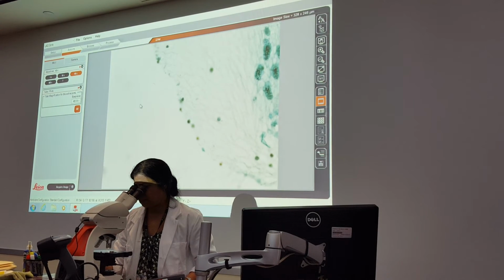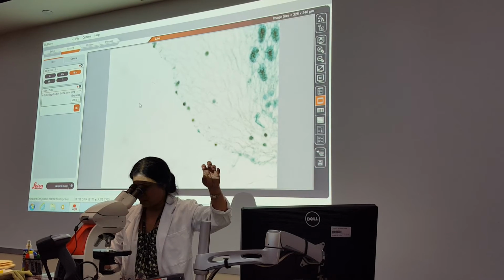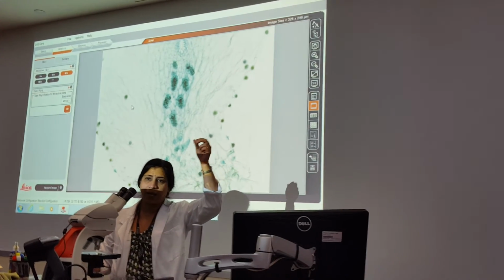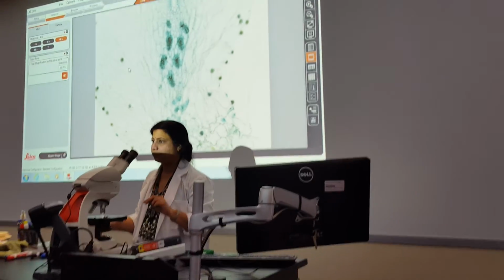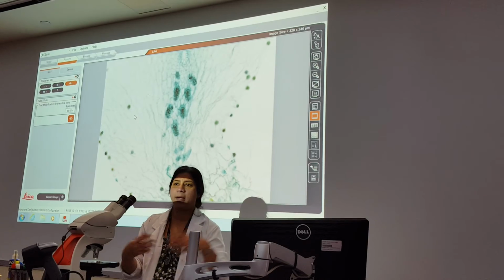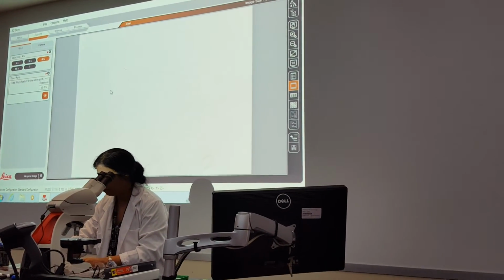These teeny tiny round ones, like grapes, are antheridia. The ones in the center, like flasks, are the archegonia. Are we good? I could ask you what the antheridia bear, what the archegonia bear, same set of questions. So that was your fern. You did 2 slides per fern.